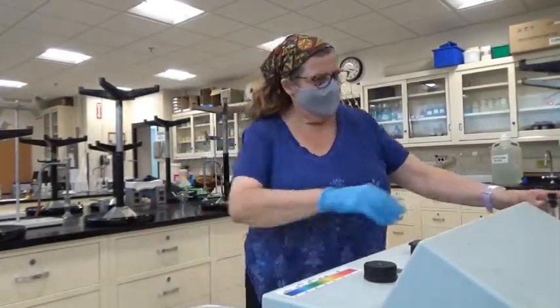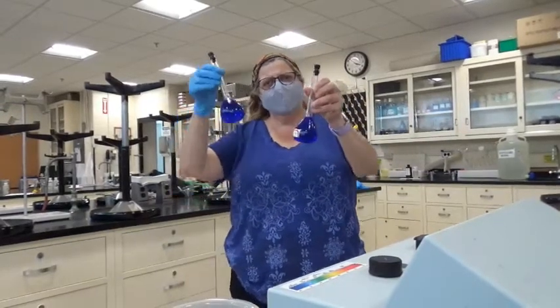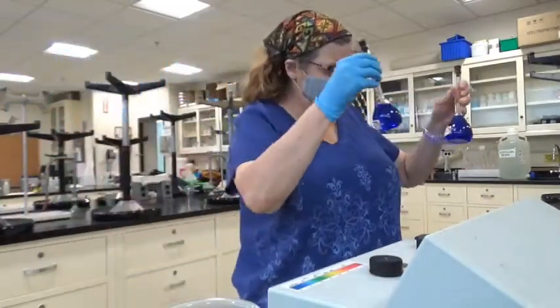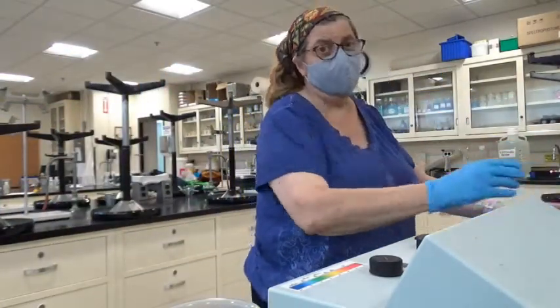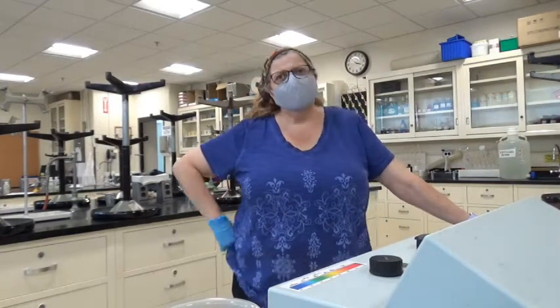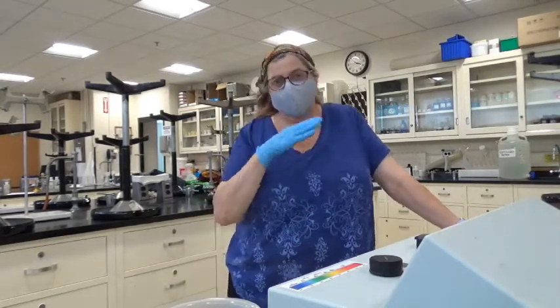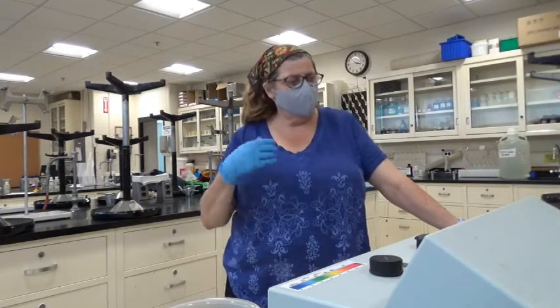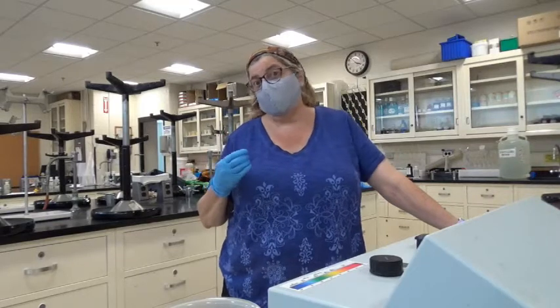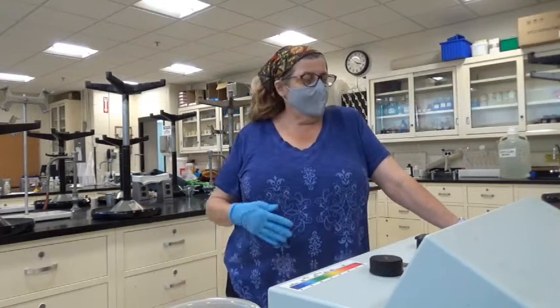Hi. So we have basically got our two solutions, the unknown and the copper sulfate solution, which we call the standard solution, because we know we're going to be able to calculate its concentration very easily. And so basically when these solutions are prepared, all of the copper in each of the solutions, whether it's from the unknown in one or the copper sulfate in the other, all of that copper reacts with the ammonia that was added and forms a different compound, which we also call a complex, an ammonia complex.